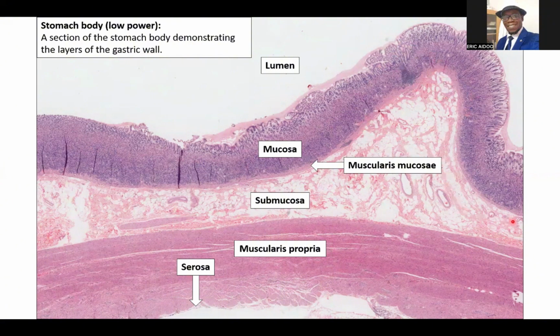And then earlier on, we were just looking at this portion where the mucosa goes with the epithelium and throws it into folds and forms the pit and the gland. Good. You can always use this muscularis mucosa as a landmark to tell you the limit of the mucosa. Then anything deep to that is submucosa. So when you say that submucosa is throwing the mucosa into a fold, this is what we mean.